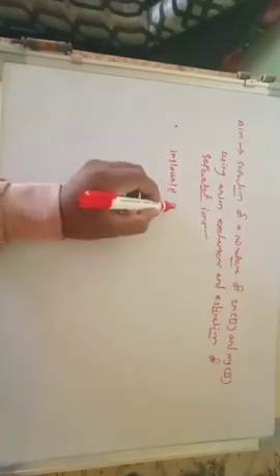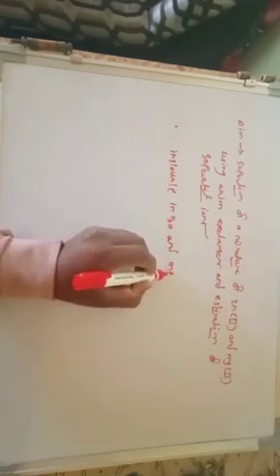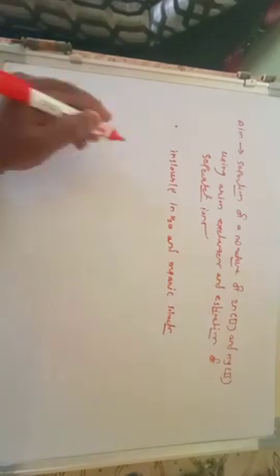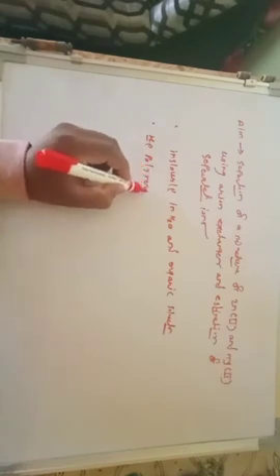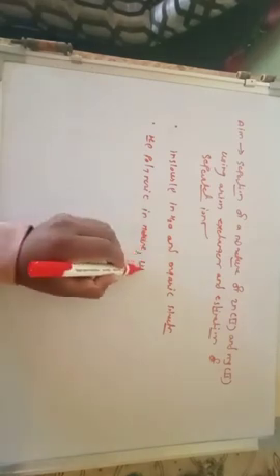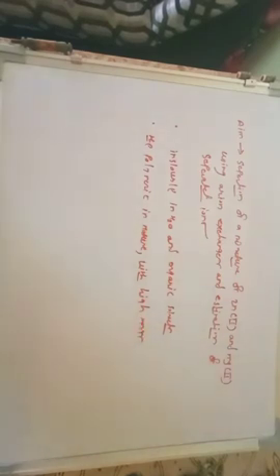They are insoluble in water and organic solvent. They are polymeric in nature, with high molecular weight. And they have the capacity to exchange the ions reversibly with the other ions in the surrounding solution.